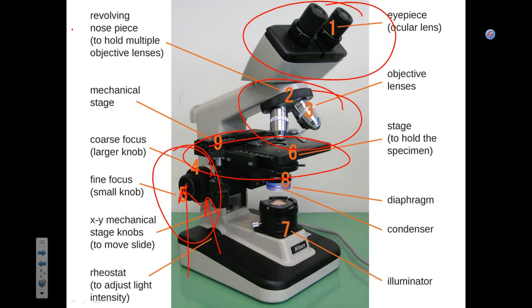One more detail that you actually will use. Do you see this tiny little lever? This one? This. I don't know how to show it better. This lever. That's the lever for the diaphragm. In this microscope, you can see it right here.